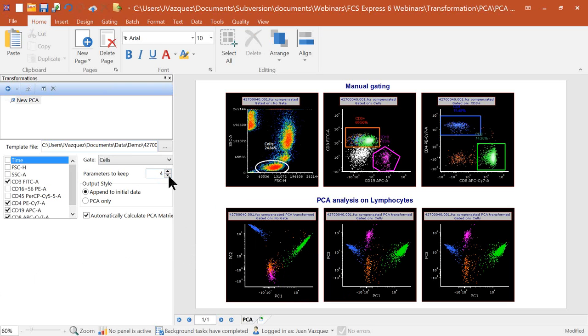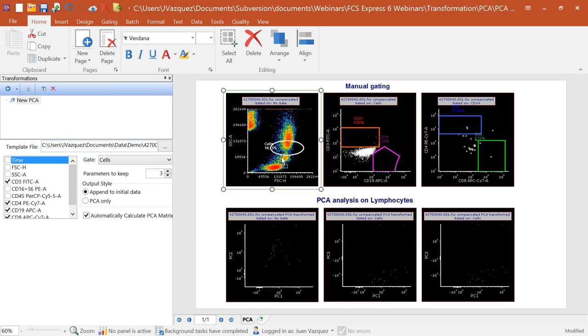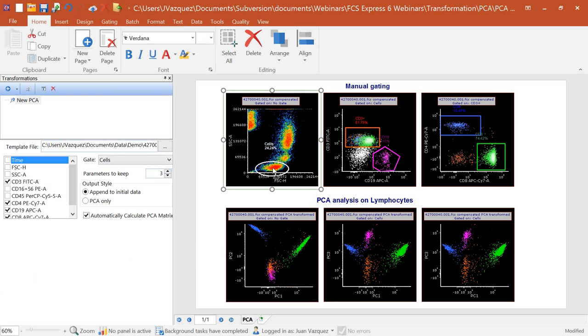And again, this all updates in real time. So as I move these around, you'll see that all my data is going to update. All the new clustering is going to be updated as well. Any colors that I've had will automatically update as well. Everything happens live in real time.